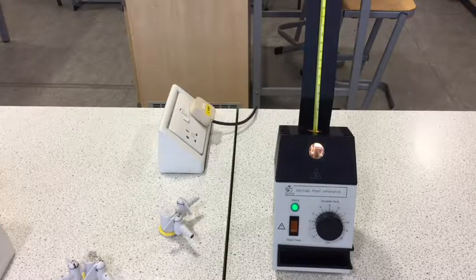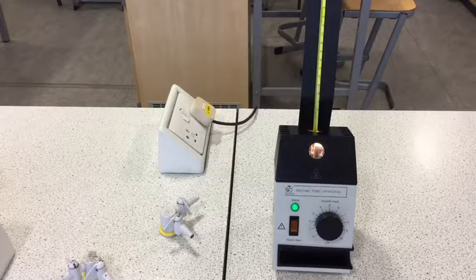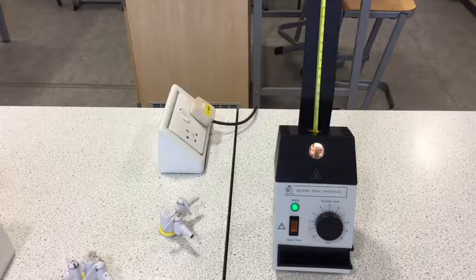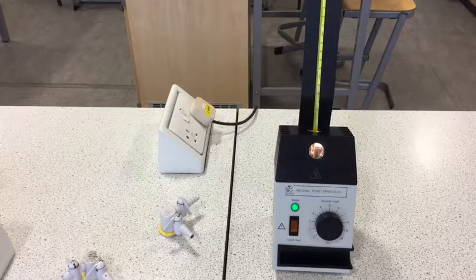We can heat it up quite fast at first until we get to about 100 degrees. Then we want the temperature to go up very slowly, no more than one degree a minute. The glass in the mercury thermometer is a lot thicker than the glass in the capillary tube, so the temperature on the thermometer tends to go up more slowly than the temperature in the capillary tube. If you're heating it very fast, the temperature you record is probably lower than the actual value being experienced by the benzoic acid crystals. But if the temperature has gone up very slowly near the end point, then the difference is minimal.